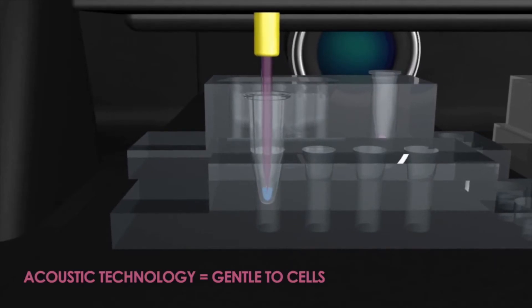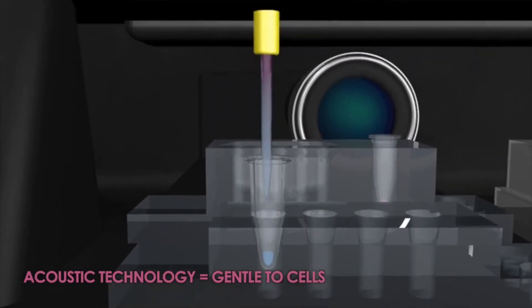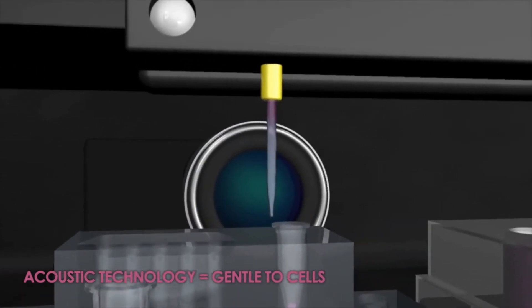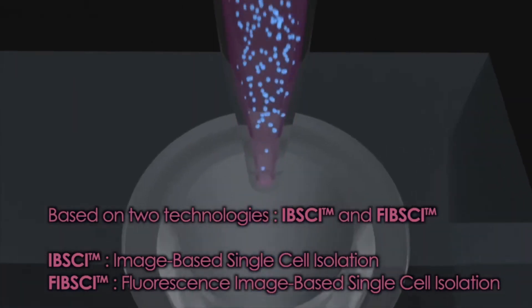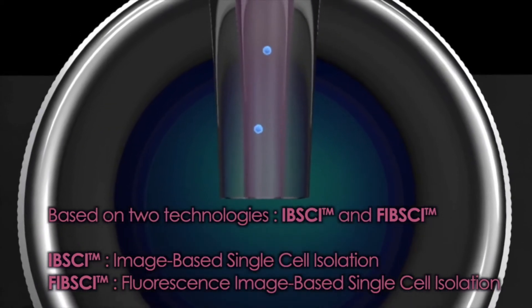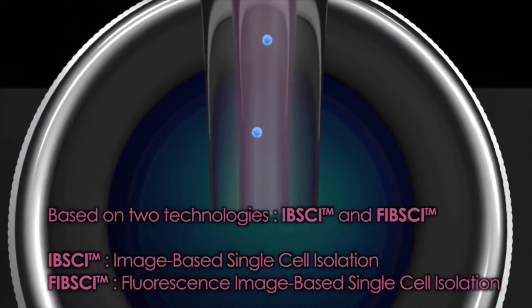Samples are generally aspirated into a reusable glass capillary in volumes ranging from a few hundred nanoliters to over 50 microliters. Our single cell isolation is image-based, and once in front of the camera, two imaging modes allow for both bright field and fluorescence data acquisition.